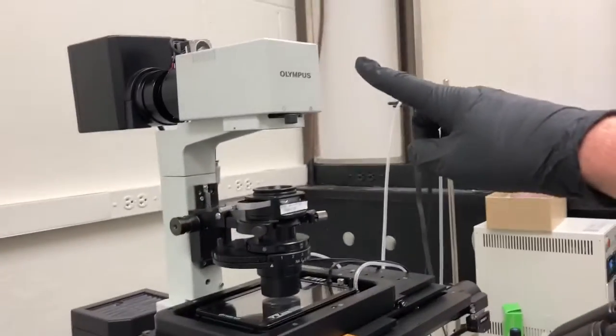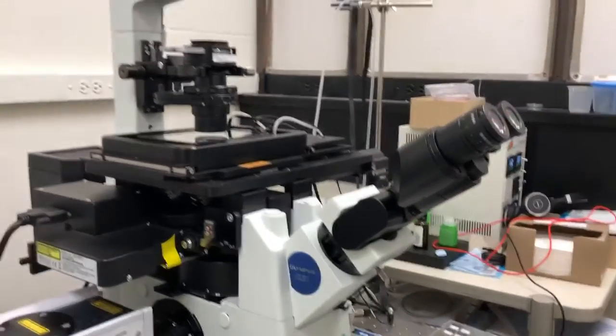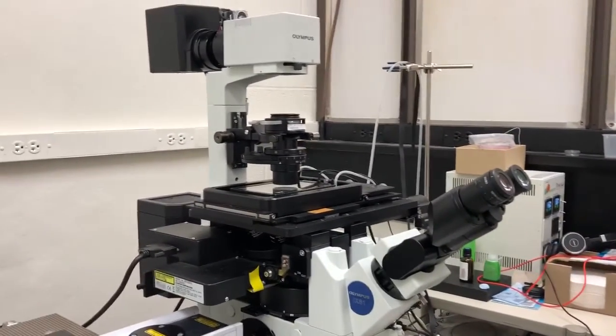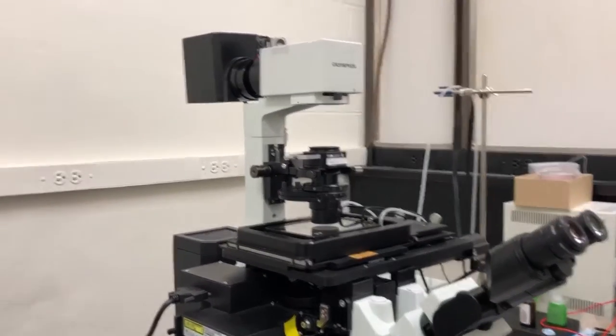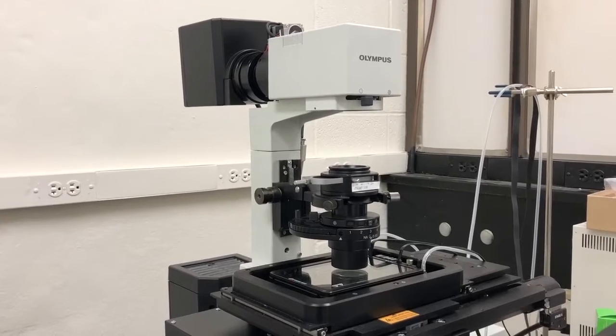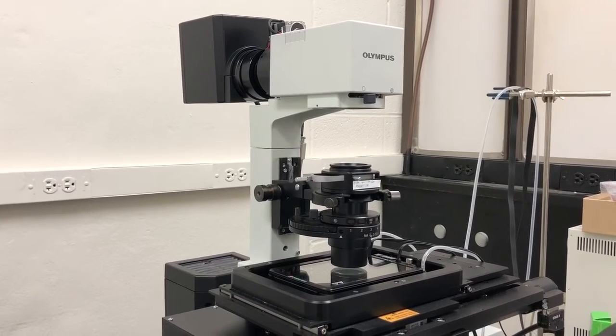So what we need is for this light to be on and for all of the components in the path to the eyepiece to be set to direct the light to the eyepiece and to not be blocked. So let's do this one step at a time. First, to illuminate the sample, this is not something that we can do on the microscope itself, it's something that we have to do in the software.